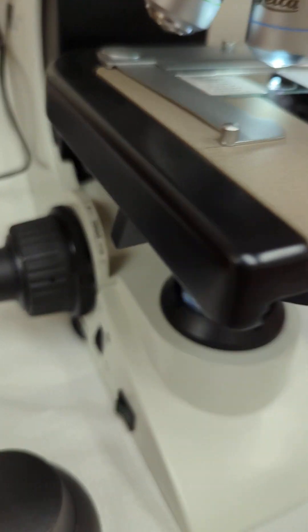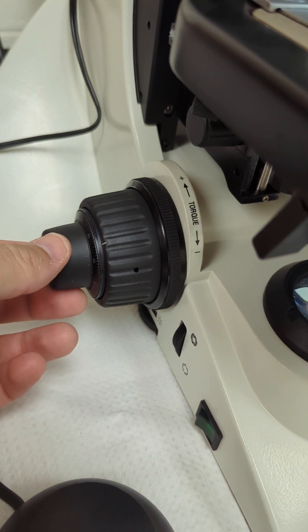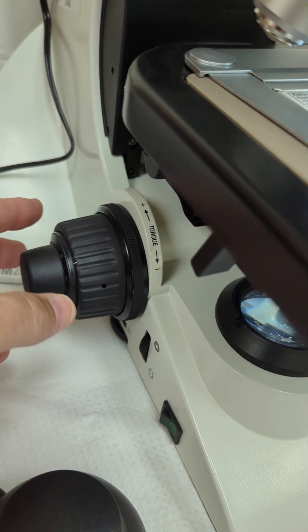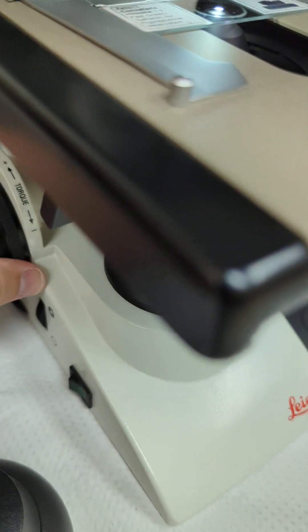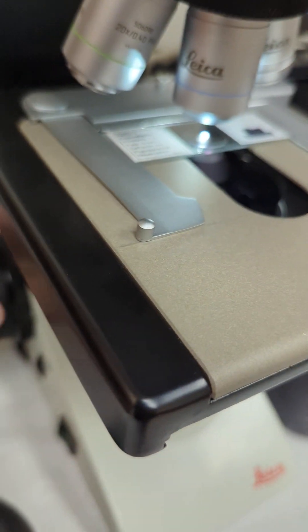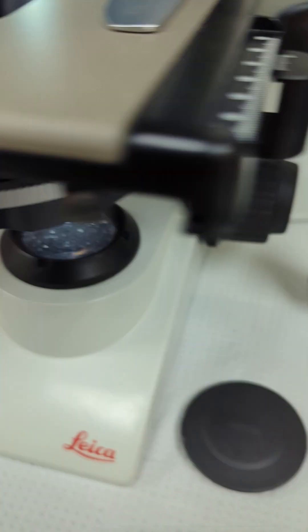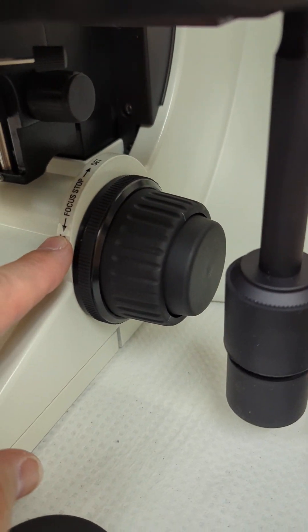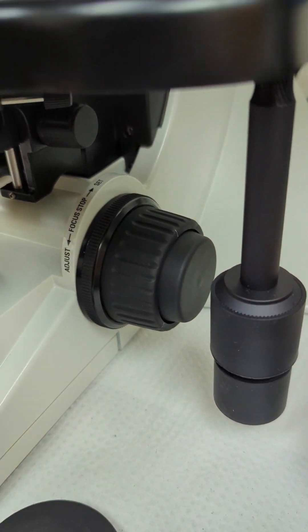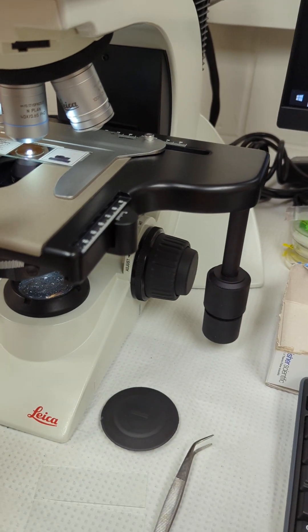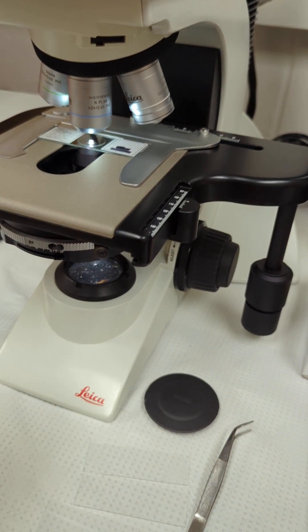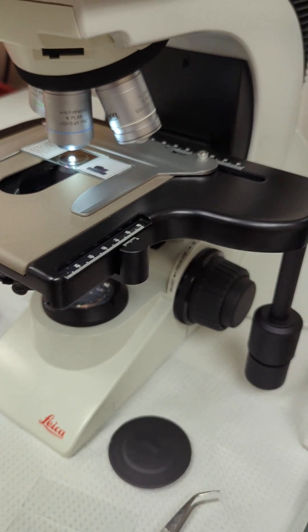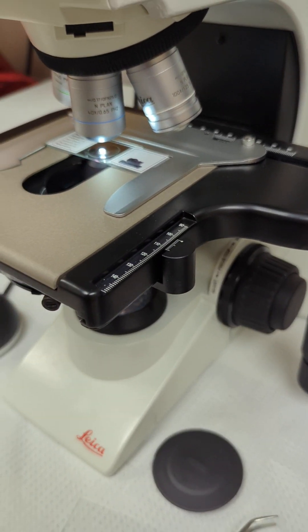Coming around to the side, here's your focus: fine focus, coarse focus. There's this torque you can actually adjust, the torque of this, how tight it is basically. On the right side, there's something called the focus stop, so you can actually create a position to make the stage stop at a certain point so it doesn't smash into the objectives. It should be set already, so you don't have to worry too much about that.